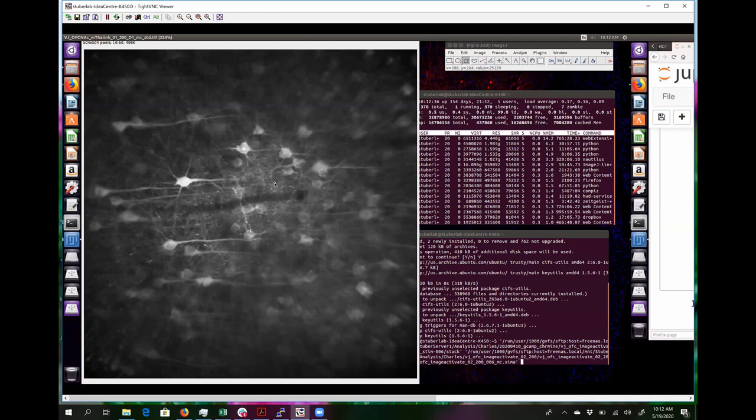Okay, so ROI drawing. There are a few things I want to say before we actually get to the ROI drawing itself. What is the purpose of the ROI drawing? The purpose is for some downstream algorithm to know which pixels comprise a region of interest, which is what ROI stands for. In this case, the region of interest is going to be cells, so the somata.